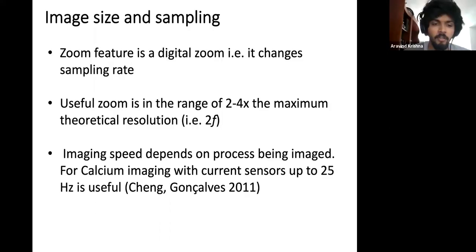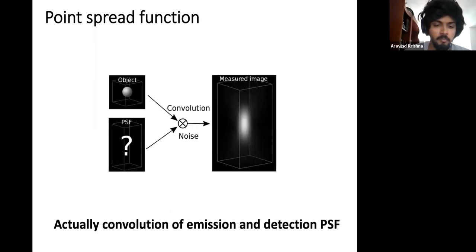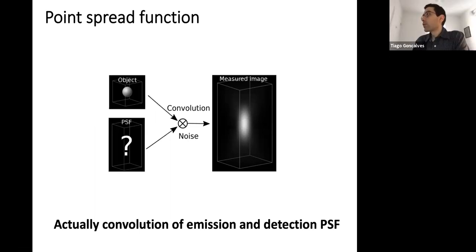So a 40x zoom, what it's doing is it's bending the light more. Therefore, the exit angle that you have is tinier than what you would have had. You're not making full use of the aperture. Okay.